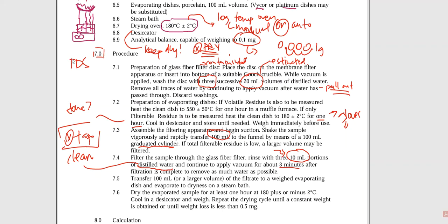And depending on the year that you're taking this class, we might have that water system in place, and we might be using that instead of our deionized water because that ultra pure water is just that. It is ultra pure, and it should just be H2O only, and we don't have to worry about these problems. And if that's the case, we'll let you know. But until that time, we're going to be using deionized water for the rinsing.